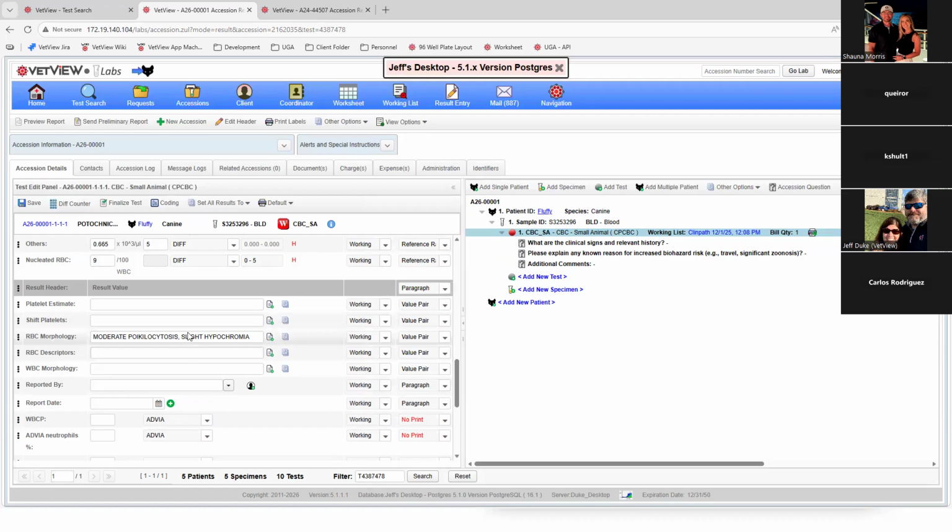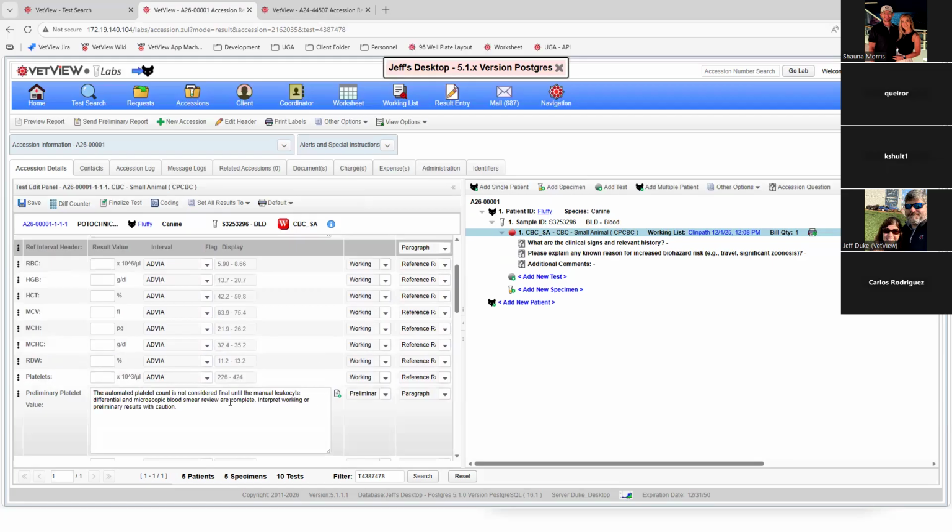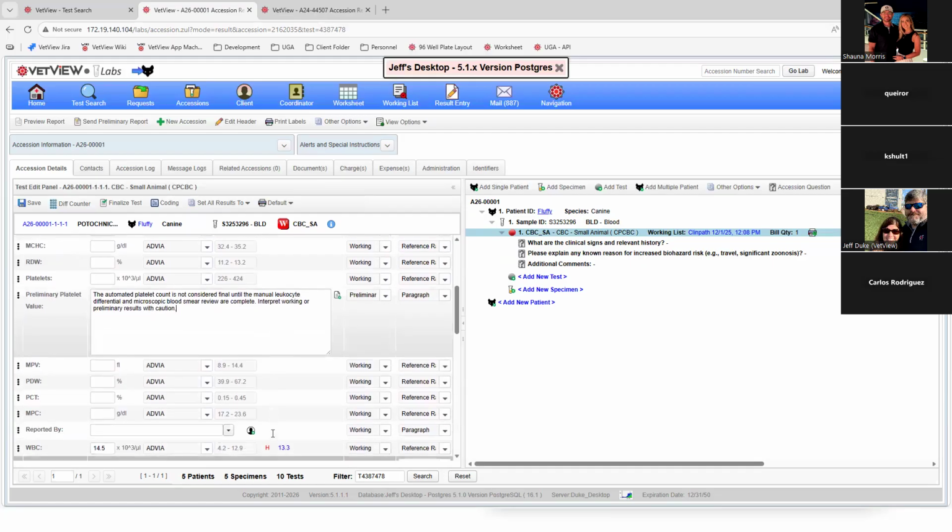On the text entry side of things, so seeing all these small boxes, the rich text boxes, any of the other plain text boxes like this one, there is no character count limits. You can put as much as you want in there. It is an unlimited text size field that you can use. Again, however you need to use that for pathology of those.